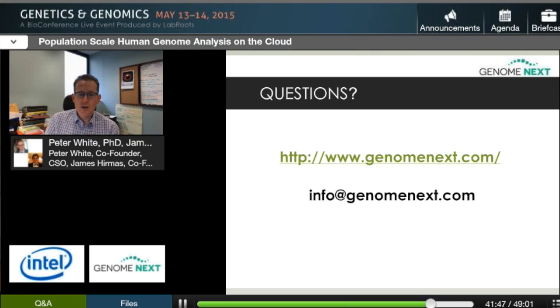And one of the advantages of using the data that we've generated with Churchill was that we could then go back and look if a variant hadn't been called by the 1,000 Genomes Consortium. We were observing that some of the variants we were actually able to call at a fairly high frequency. We believe this is really an effect of doing an apples to apples comparison, that when you're filtering your data, ideally you want to use population frequency data that's been generated with the same method that you use to do your particular study. So I think that's one way that we're hoping to see this sort of impact our ability to more accurately determine whether a variant is common or if it's pathogenic.